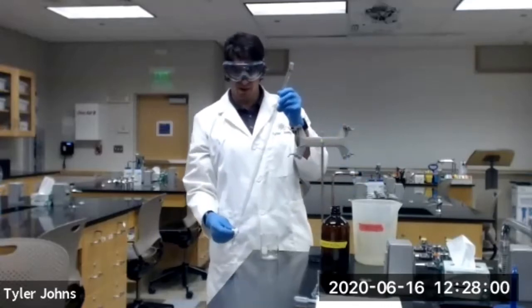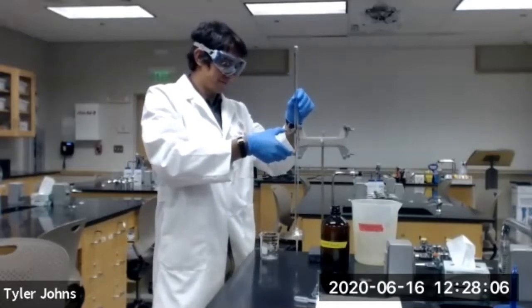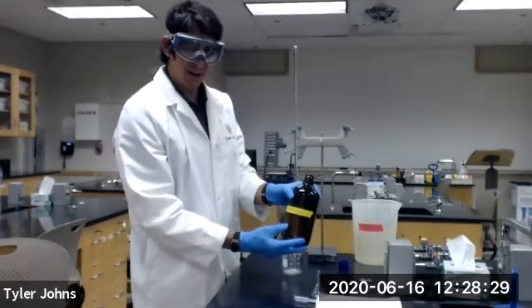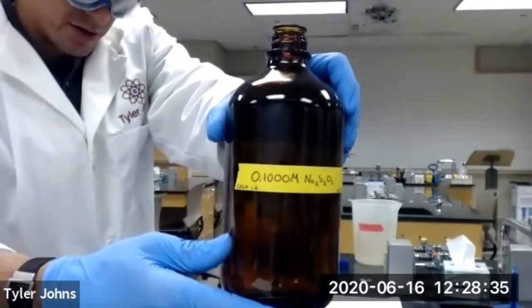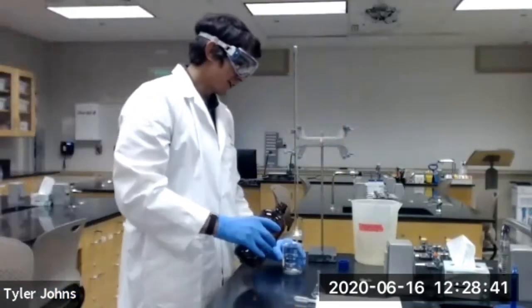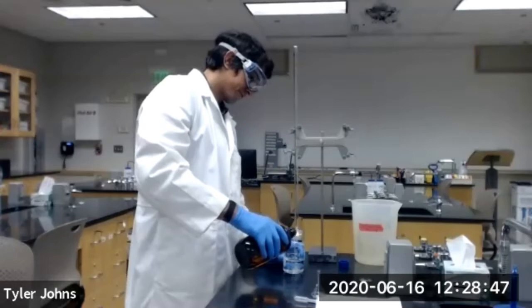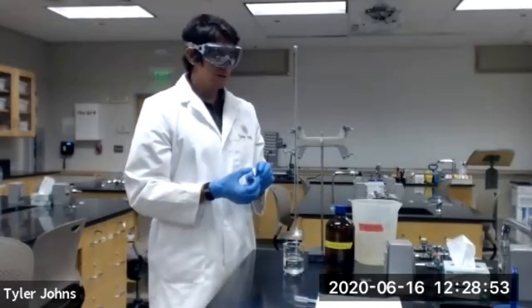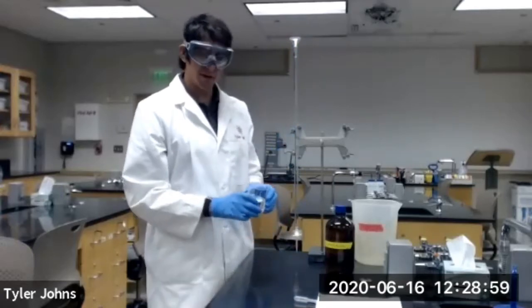Make sure you close the stopcock. Reinsert your burette in the burette clamp. We're then going to take 100 milliliters of our standard solution, again, the 0.1000 molar sodium thiosulfate, and transfer it into a 250 milliliter beaker. And then we're going to use our funnel again, and fill our burette with our standard solution.